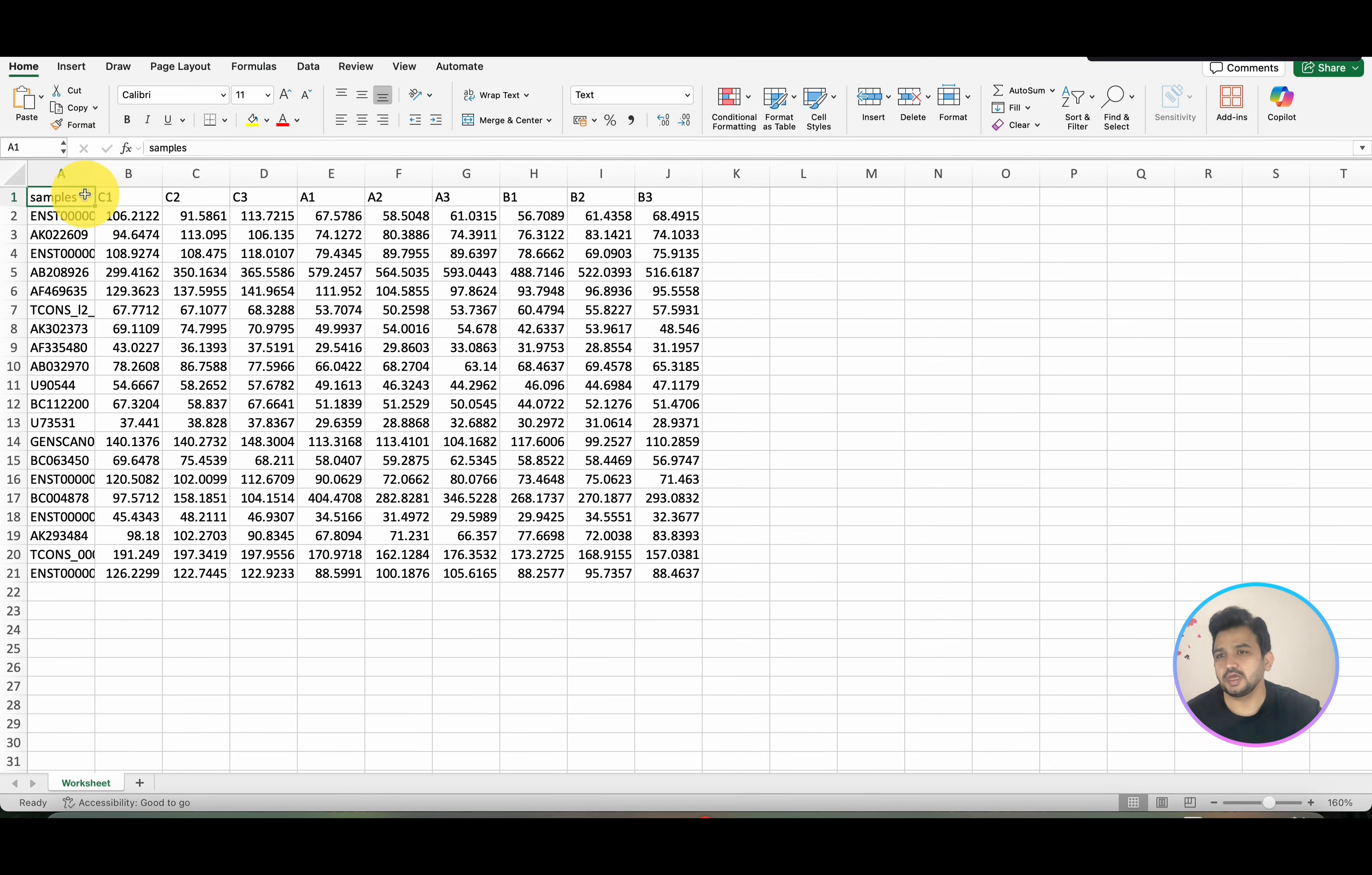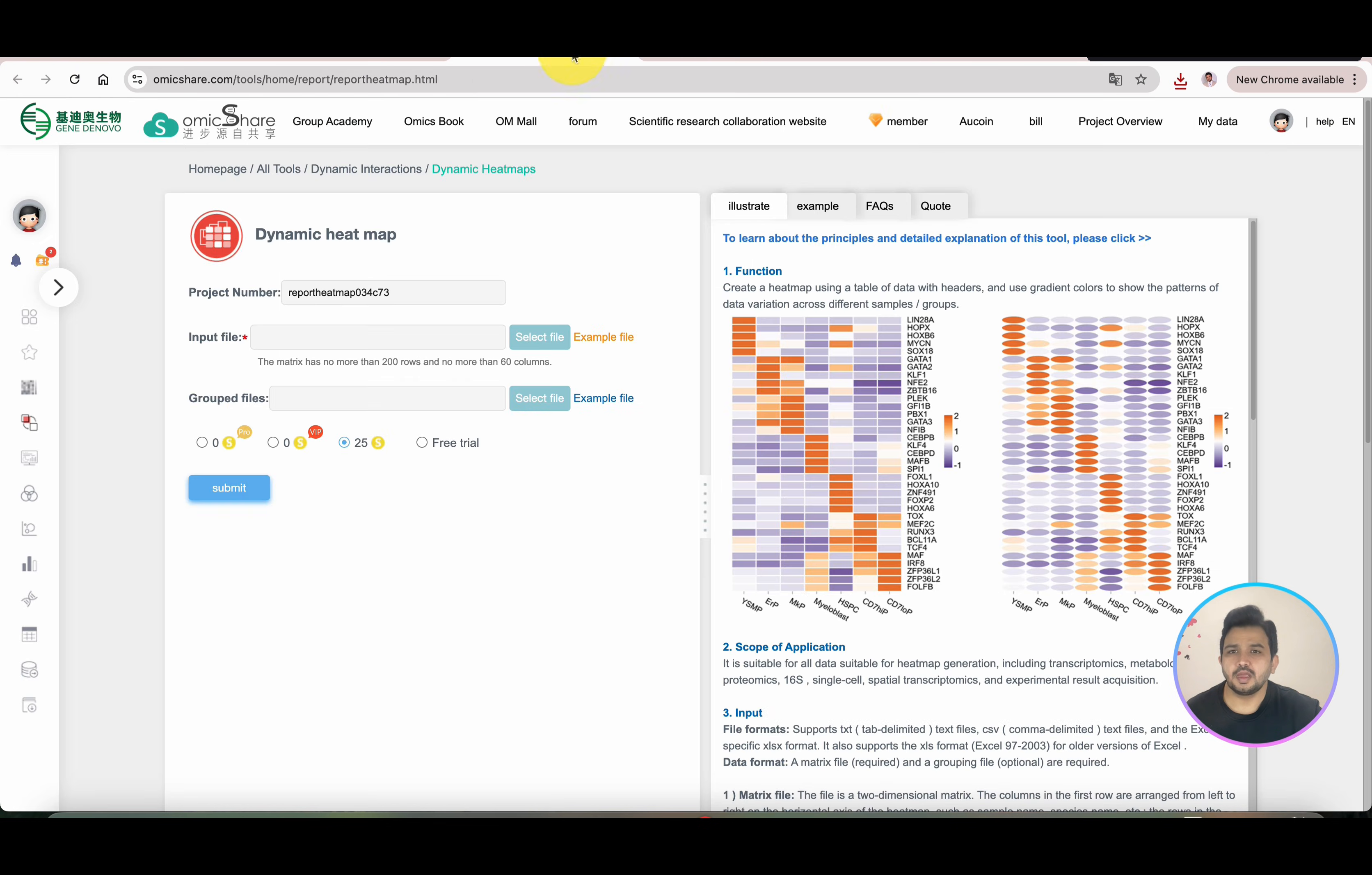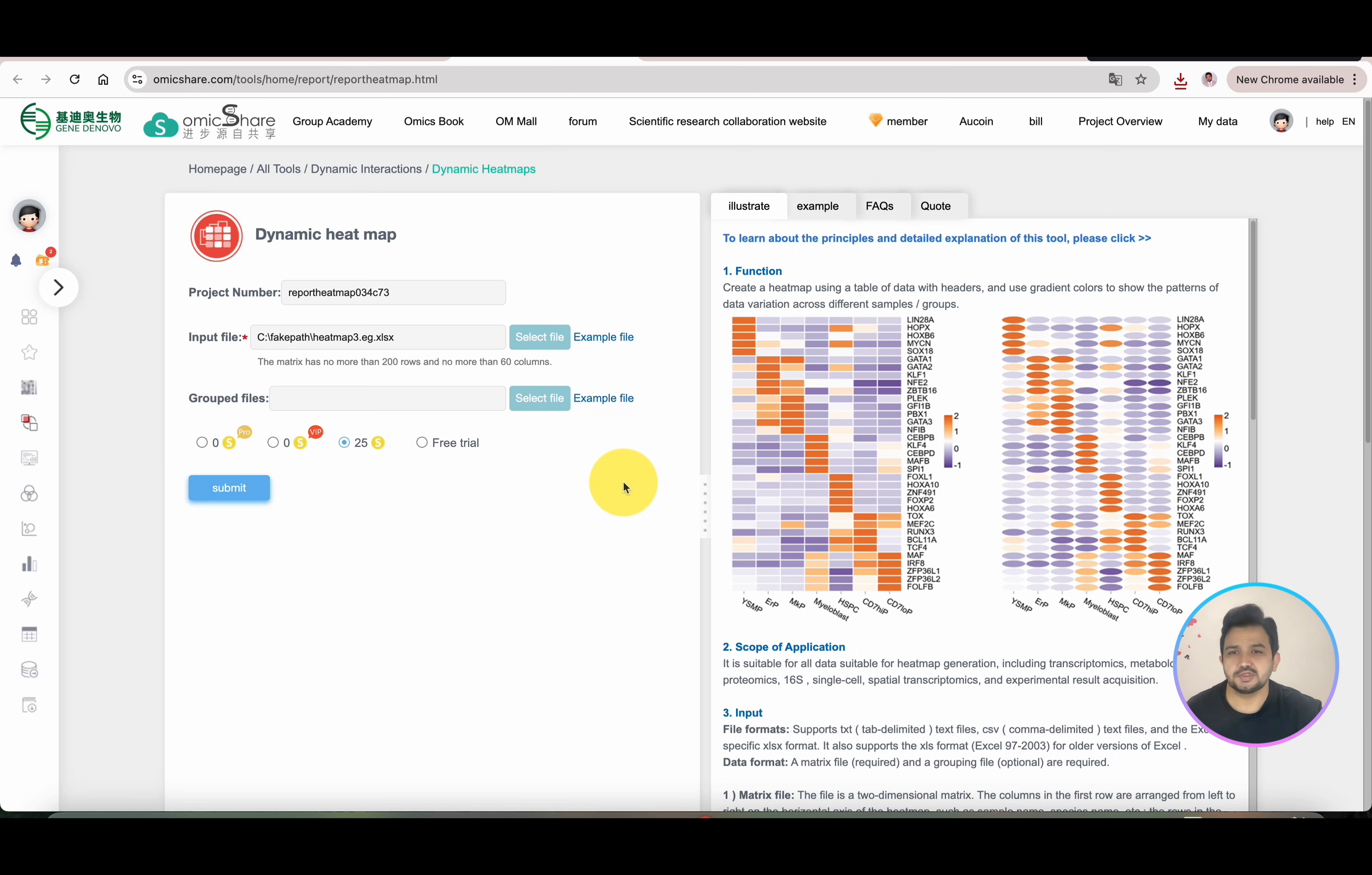I have already downloaded this file and can show you. Here are your samples, gene names, and different treatments like C1, C2, C3. Treatment C has three replicates, treatment A has three replicates, and treatment B also has three replicates. I will directly go into that tool and upload this file. Once you click on Upload File, you can, if you're a Pro member, purchase space. If you're not a Pro member, you can simply go to your computer and upload your file from your system.